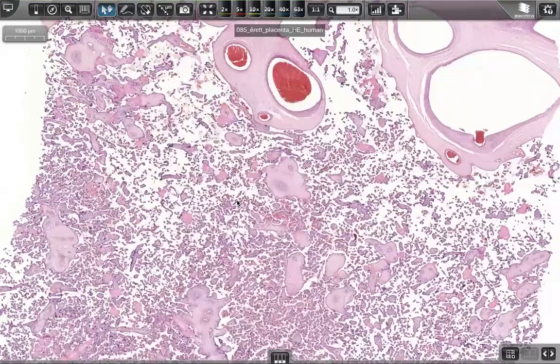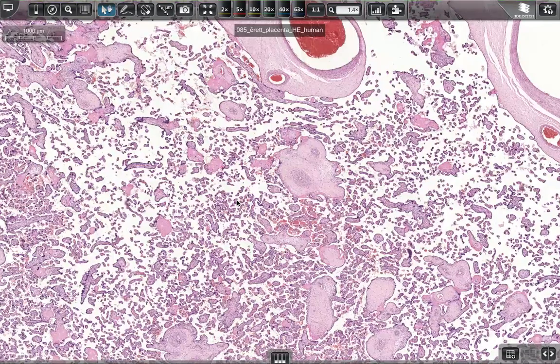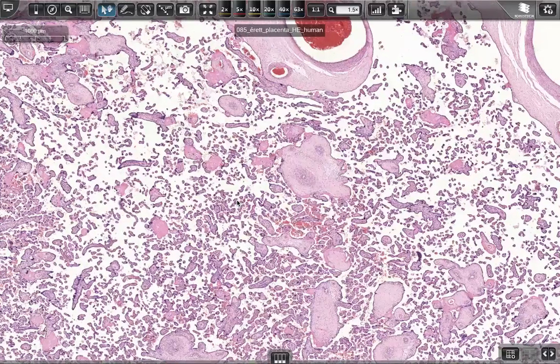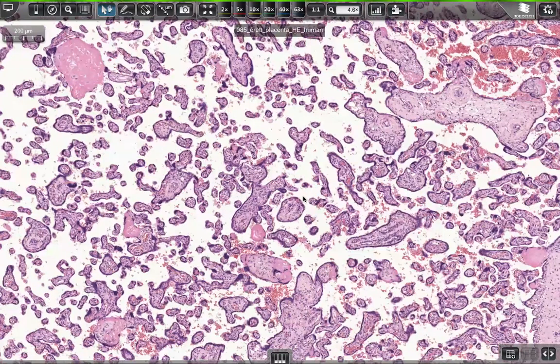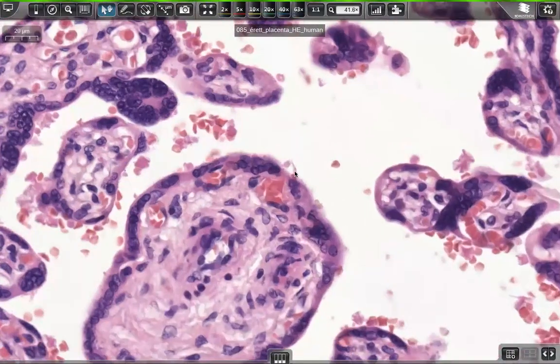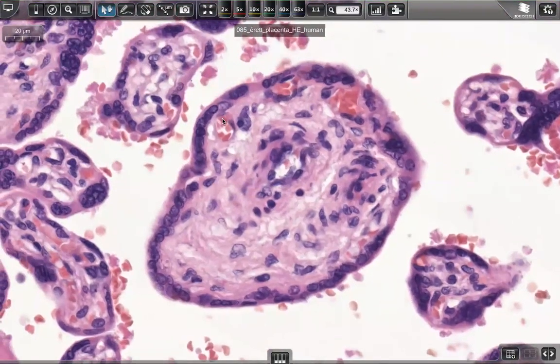Now let's see the villi here. I told you we have 3 types of villi, and in the full-term placenta, we have only tertiary villi, the well-developed villi, having trophoblast layers, mesenchymal core, and fetal vessels. So I choose this one. This is a proper cross-section. These are the syncytiotrophoblasts; you know, the cytotrophoblast is reduced at the end of the 4th month.